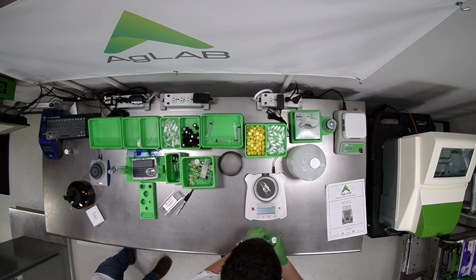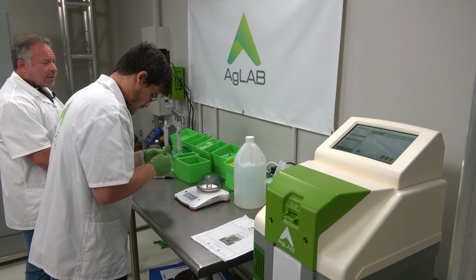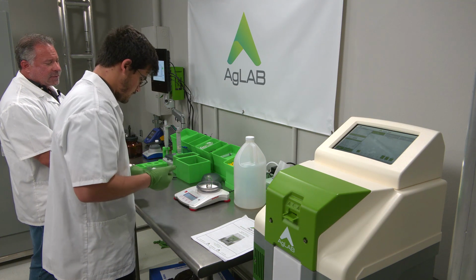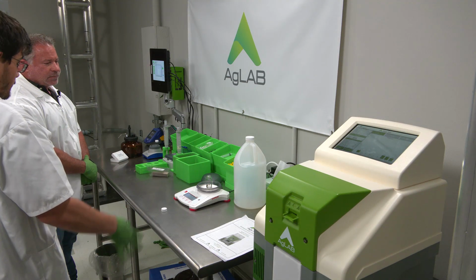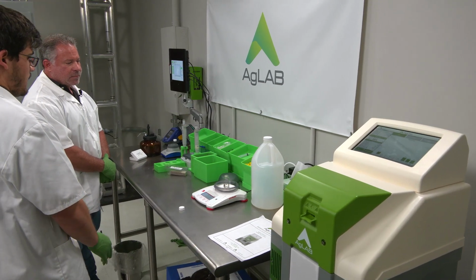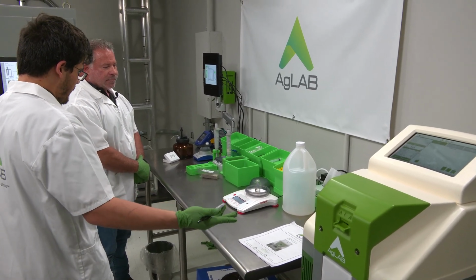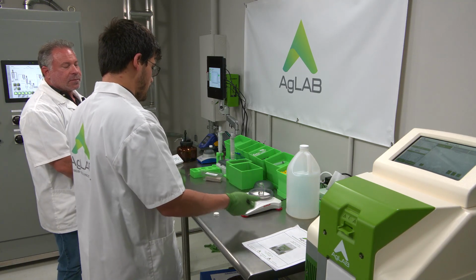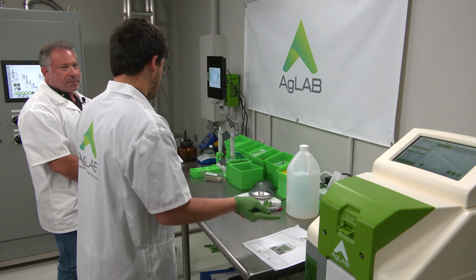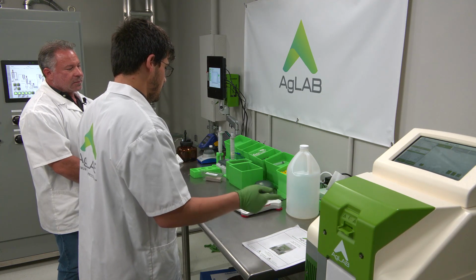So what are the major differences between the heads samples and the tail samples? Really, the two main differences are the target weight that we're scooping. For head samples, we want to get 50 milligrams. For tail samples, we want to get about 20 milligrams. Then the other main difference is the filtration.